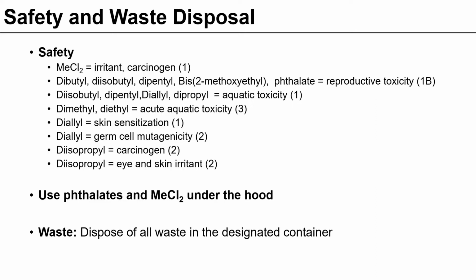All of these phthalates are also, like I mentioned in the beginning, toxic compounds suspected of causing some nasty endocrine disruption in animal systems. You are an animal, so let's try and be clean when we're using the balance.